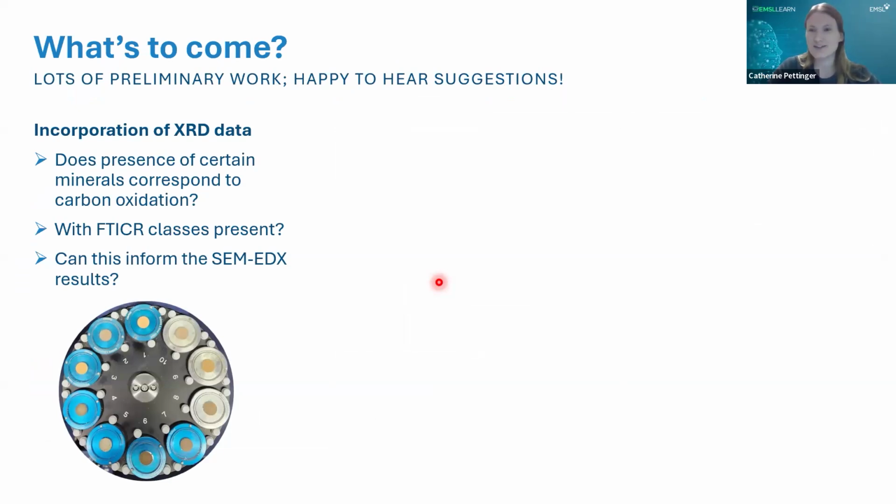I'm happy to hear suggestions. As both a grad student and an intern, my main job is to learn. So if you have any suggestions moving forward, feel free to contact me. Right now, I'm also looking at incorporating some XRD data, especially as we start to look at different minerals that might be involved, if any of them correspond to different carbons that are present.